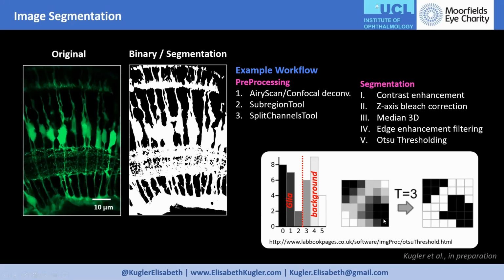Now towards the edge of the Müller glia, the pixels gradually become lighter, until it reaches the white background. This creates a gradient between the Müller glia itself and the background. However, along this gradient, we also reach these lighter pigmented pixels, these light grey pixels. And one of the challenges we face is determining whether these lighter coloured pixels are part of the Müller glia itself or artifacts in the background.